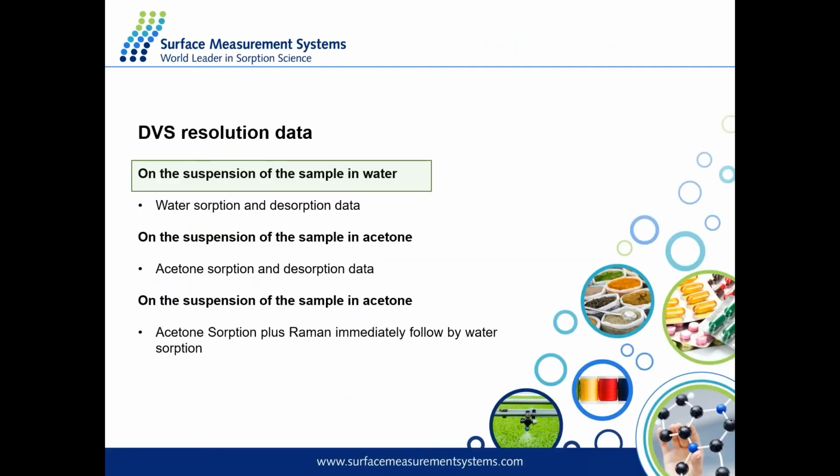The more advanced study that I want to show you today is the formation of a hydrate and a solvate, specifically of carbamazepine. We are doing a study on water absorption for carbamazepine and then with acetone absorption. We're going to do a study first with just water, then just acetone, and then we are going to try to generate the hydrate, and generate the solvate with acetone, and see what happens when we start pushing in water. Is the solvate much more stable than the hydrate, or does it move back to the initial form? So let's start from the first section.